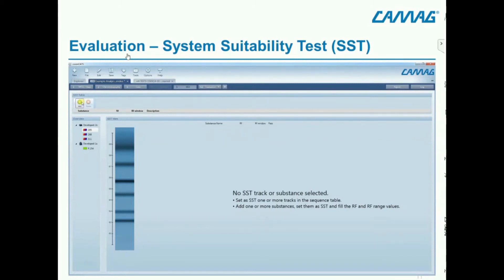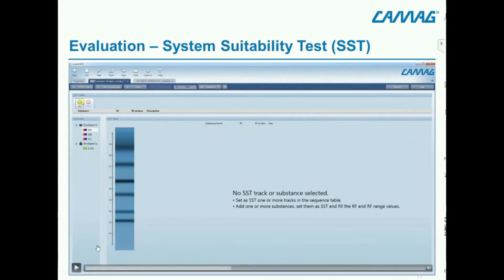The CAMAG recommendation is that on the same day in the same lab, the RF value should not vary more than plus/minus 0.01, so the window is 0.02. For different days, the tolerance is plus/minus 0.025, meaning the window is 0.05. We have an analysis from the same day.